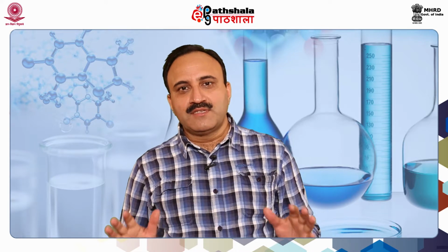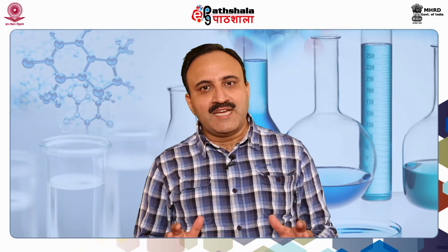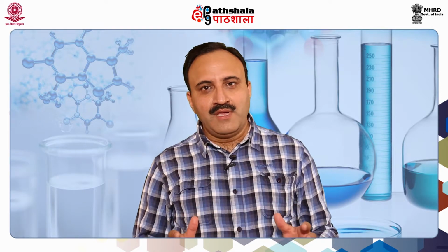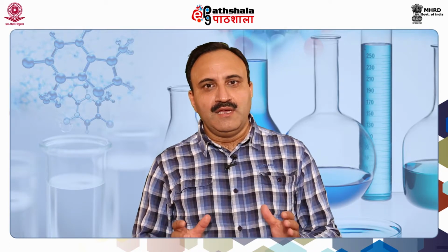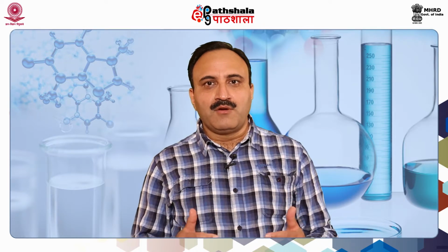So today I will be discussing with you one of the very important, familiar and versatile techniques in the field of chemistry, that is gas liquid chromatography, or in short, its popular name is GLC. This technique is based on the principle of partition chromatography.